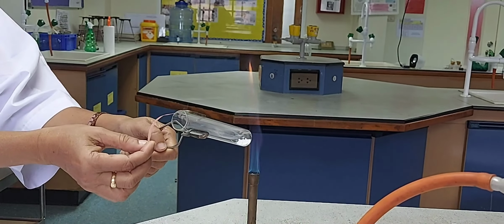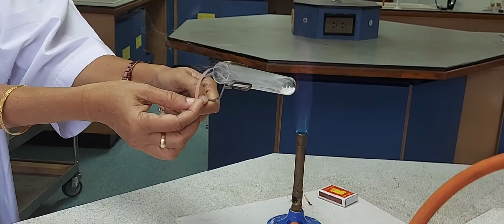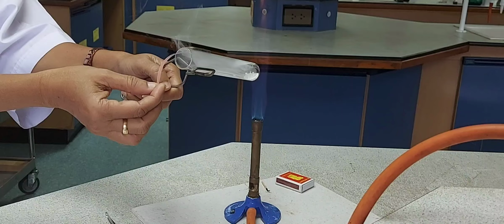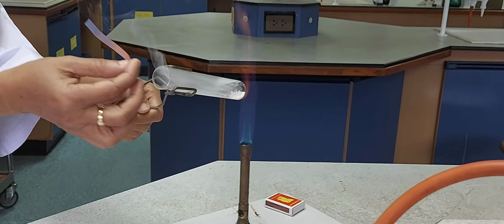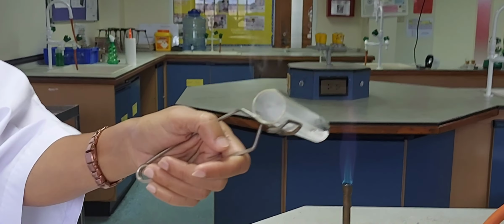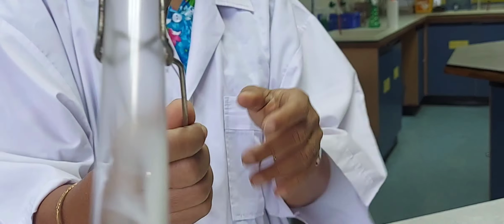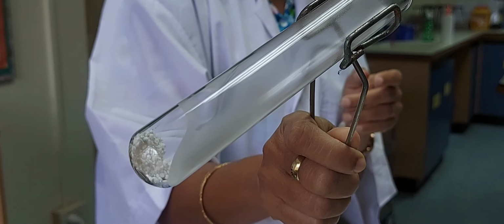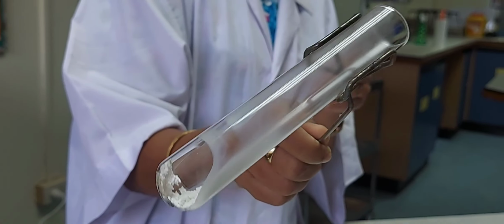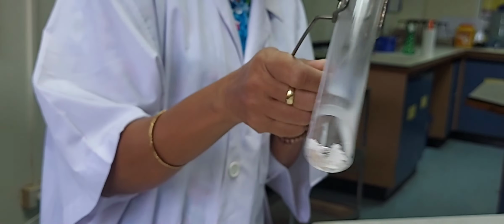So you can see the white fumes of the gas being evolved, and again the litmus paper is turning blue, and this gas given out has a pungent smell, so it is ammonia gas. The white fumes, yeah, you can see the sublimation also happening. Ammonium chloride that has also sublimed, and some has reacted with the base to give the ammonia gas.